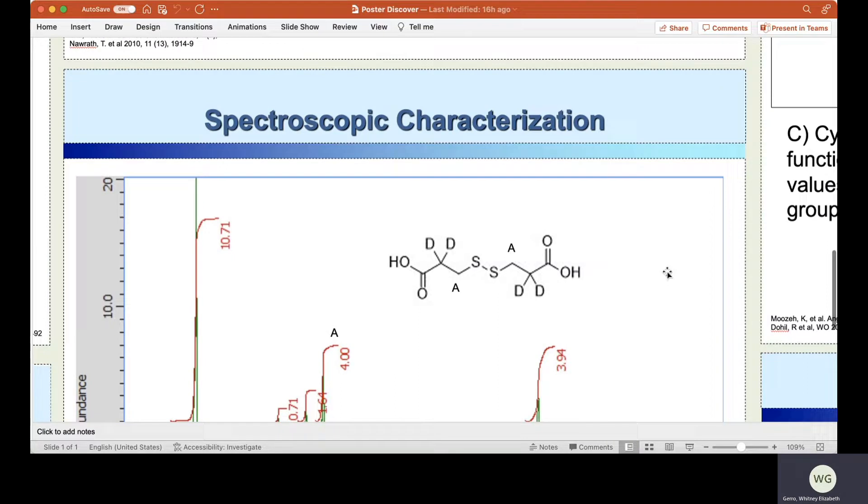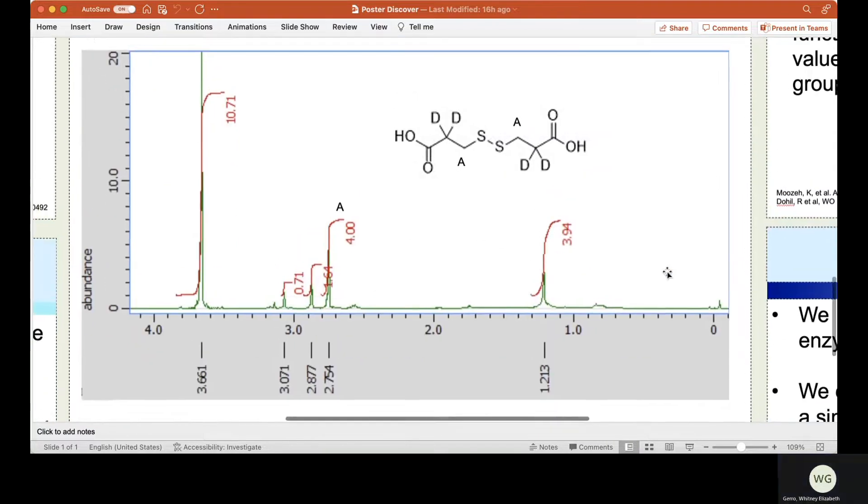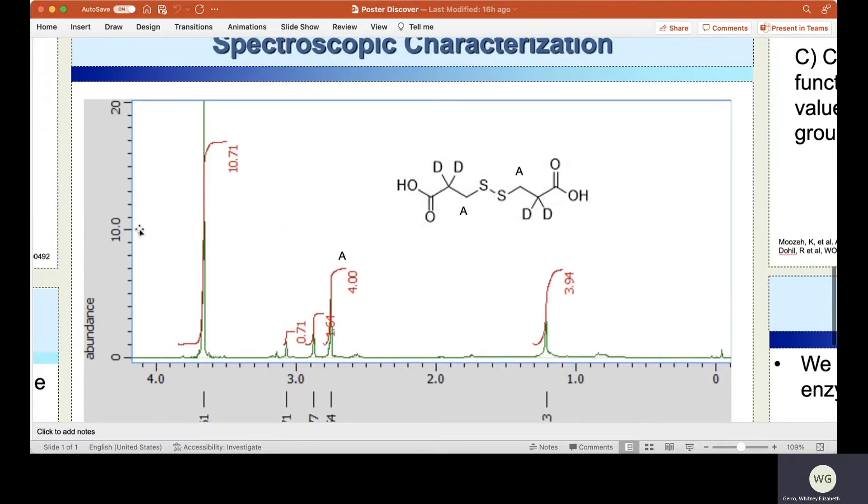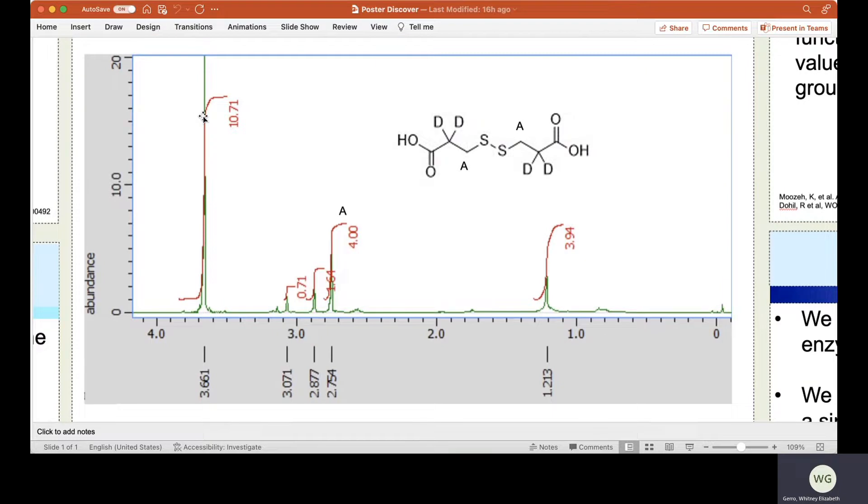Looking at our spectra, beginning with our NMR spectrum, starting here on the far left, we see the methanol the reaction was running with its characteristic peak at 3.661. However, what is of interest to us is peak A, which corresponds to the protons on the beta carbons of our molecule. We also see other peaks, which sadly indicate the presence of compounds that are not our molecule.